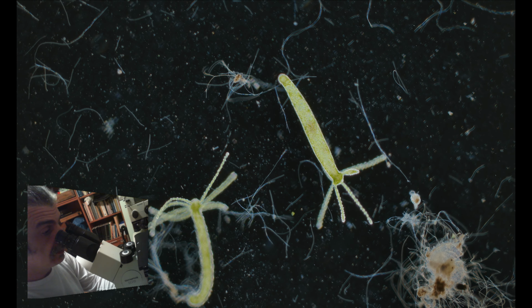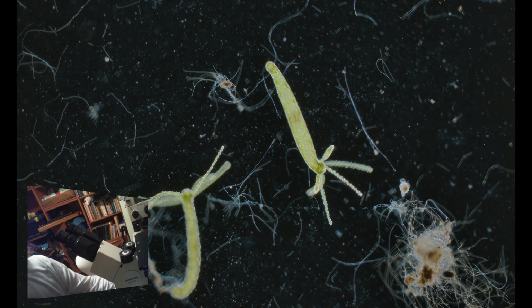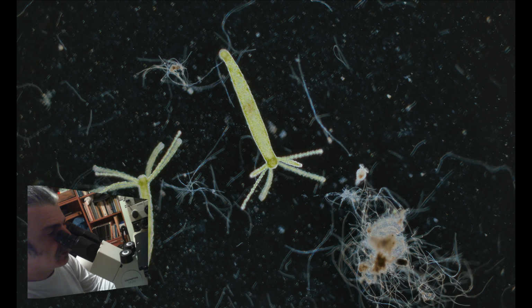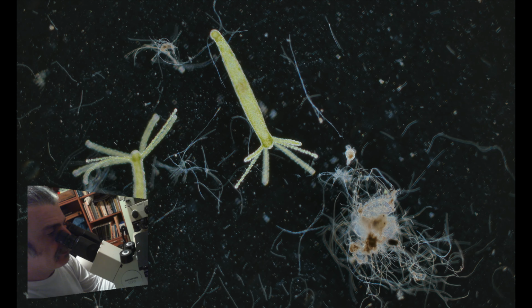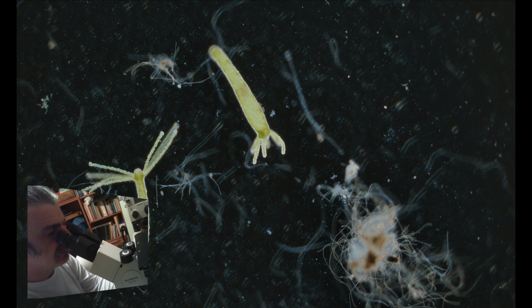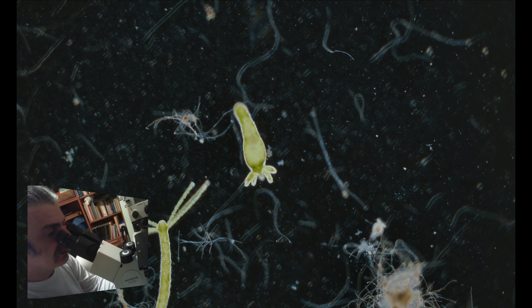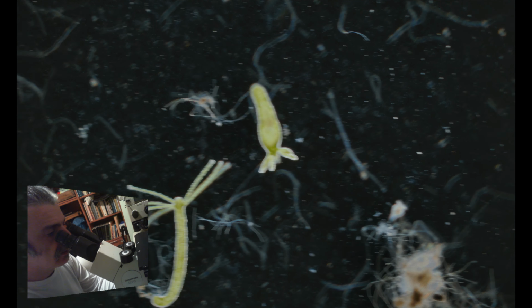Right at the beginning we can spot here two large hydras. Hydras are relatives of medusas, of jellyfish. They belong to the same class. They both possess nematocysts, which are venom cells on their tentacles. We can see it comprises a large body that contracts and a number of tentacles.